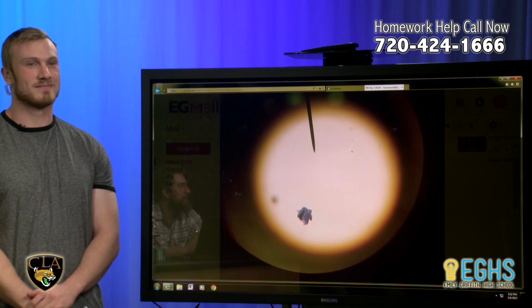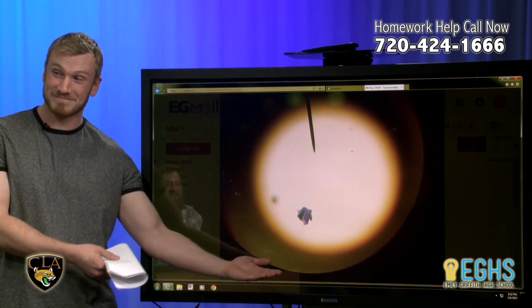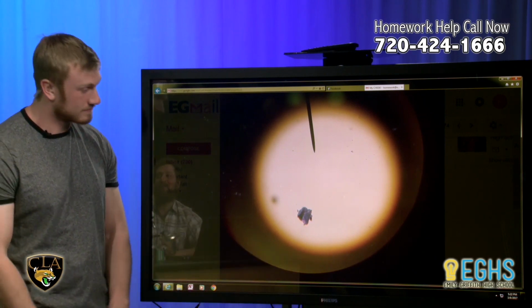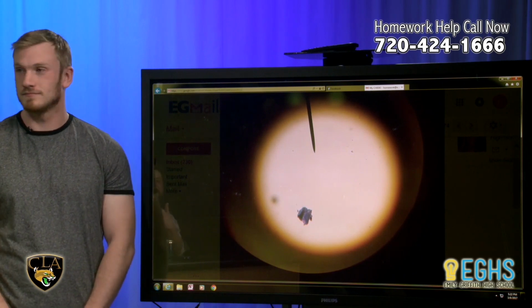So my awesome cheek cell picture actually came through. Let's show you it. Don't judge my photography skills. It's not the best. But that right there, you guys, is my cheek cell. I think it looks like more than one cheek cell folded on itself. So what you often get is multiple cells kind of together. And definitely the fact that it's darker.